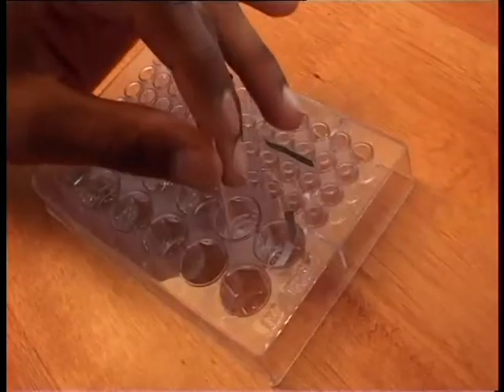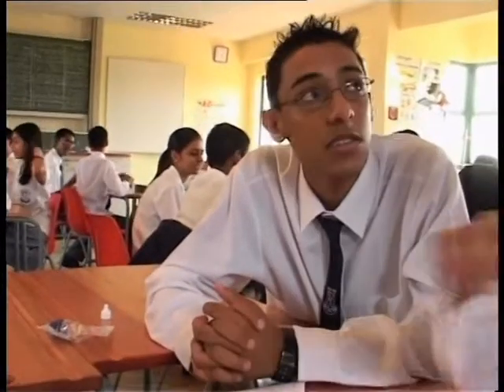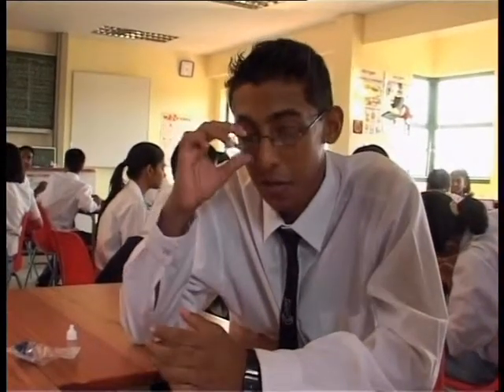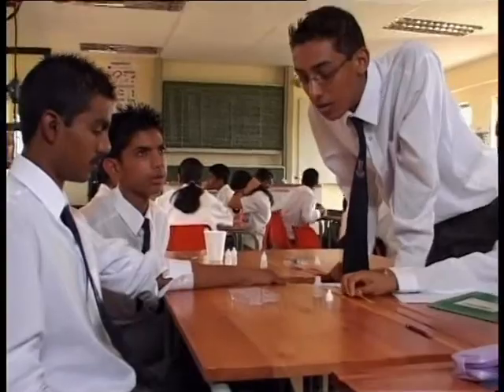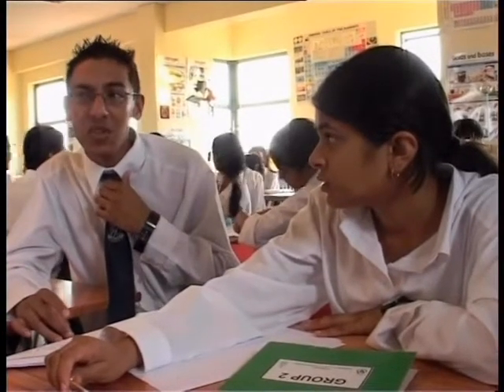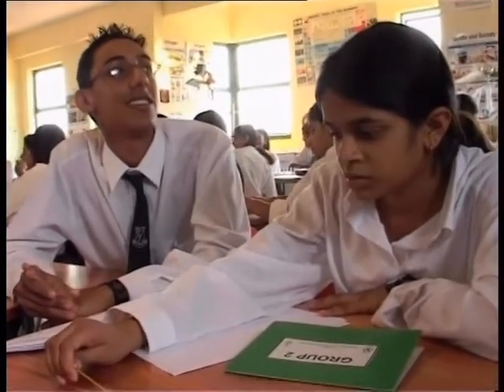For test 3, carbonate is mixed with the aqueous solution. Was it necessary to dissolve the calcium carbonate in water? It wasn't necessary because we would have dissolved it in substance B, because substance D is a liquid. Is there a reaction there? Yes. What do you see? Small bubbles. Calcium carbonate plus an acid will give us salt, water, and carbon dioxide. So what are those bubbles? Carbon dioxide.